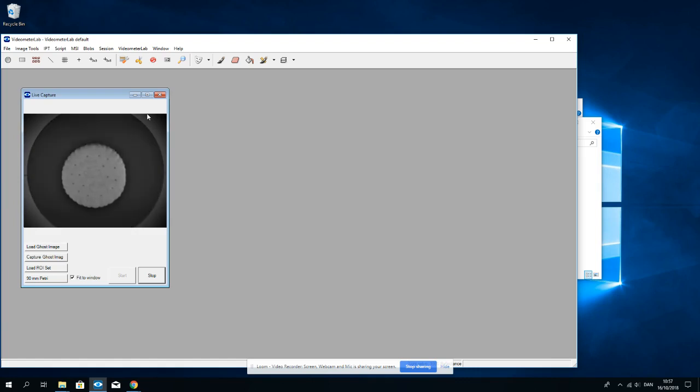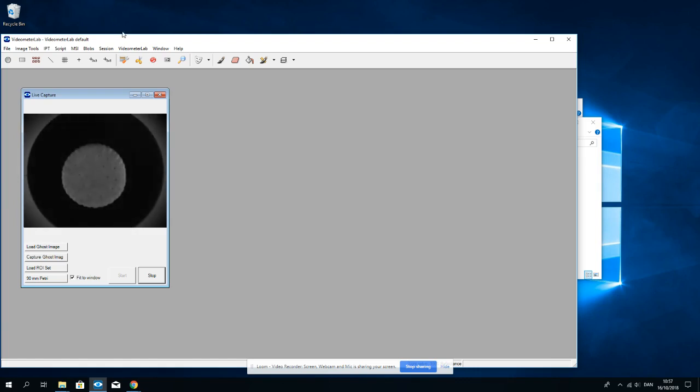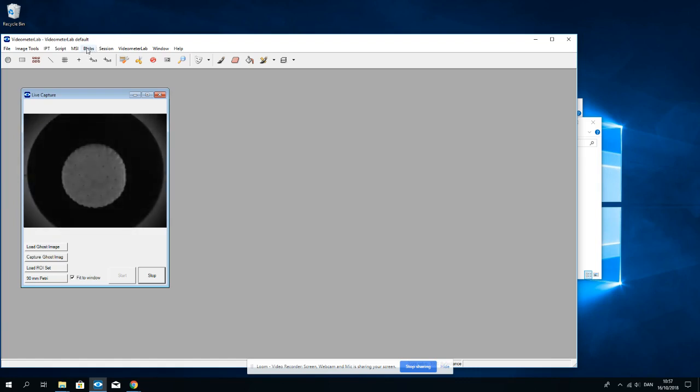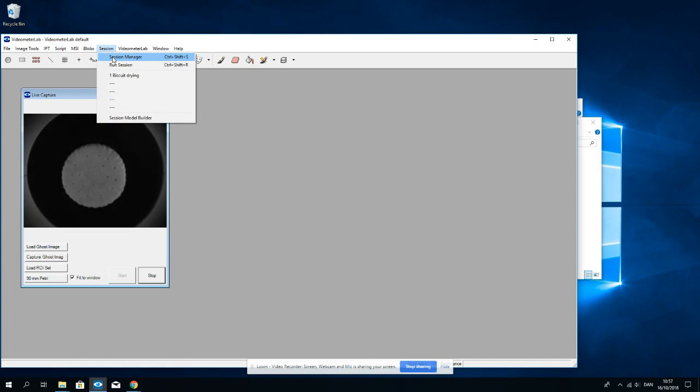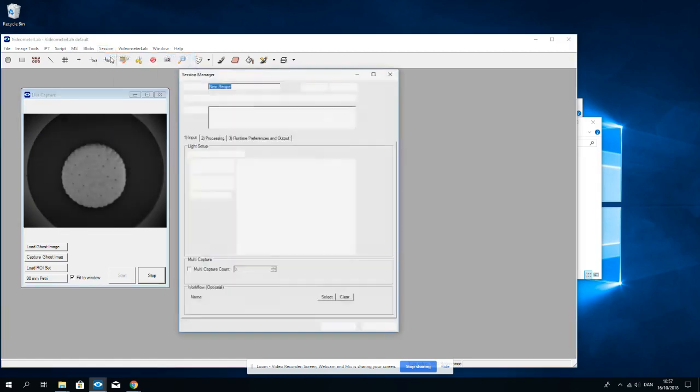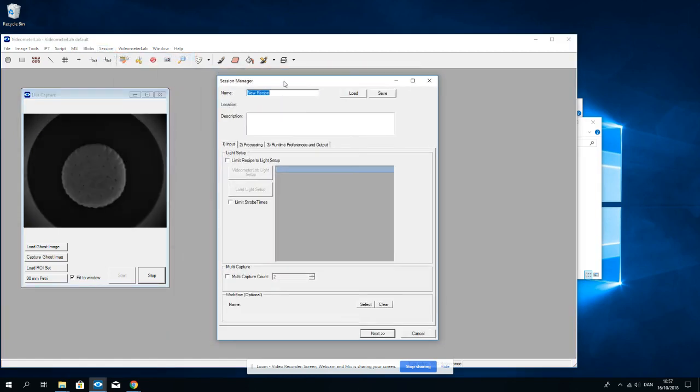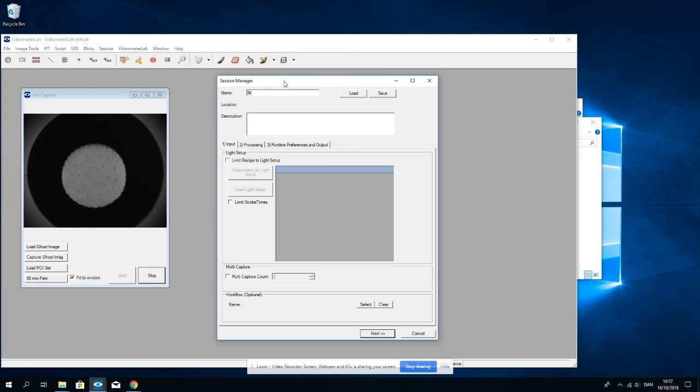So how do I do this? I go to Session, Session Manager, and I name my session biscuit drying.